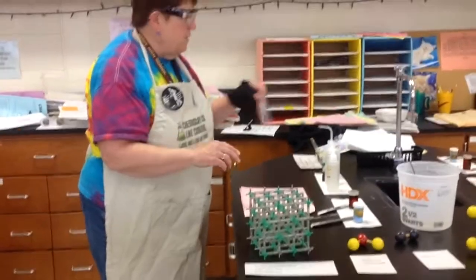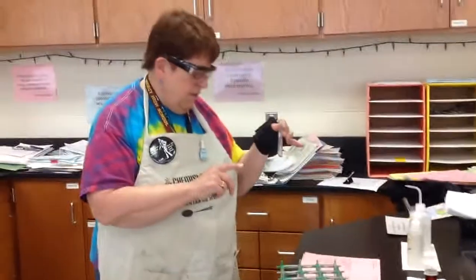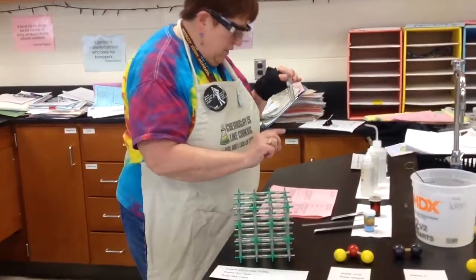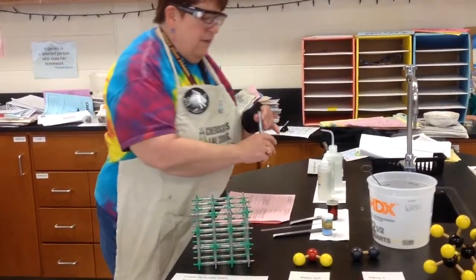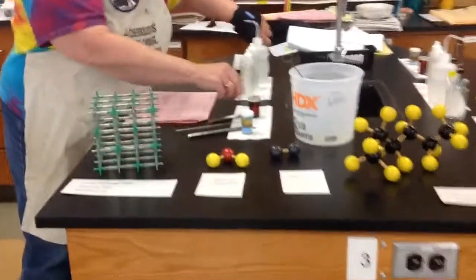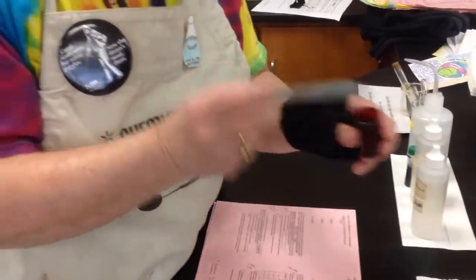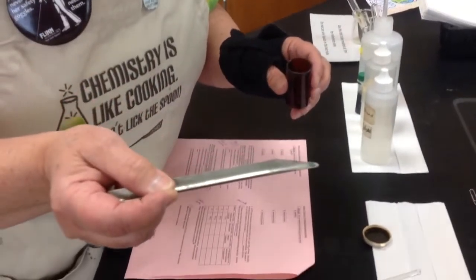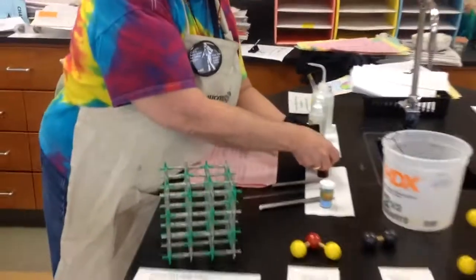All right. And then you will do a similar thing with water again, just with water in the 2 test tubes. And then it says a match head size amount of iodine in 1 test tube and a match head size amount of copper sulfate in the other. So the solids are here. Match head. You know what a match looks like. Just a little teeny tiny bit of this. If you use too much, you will not be able to tell what you are doing. And that's probably more than a match head right there, like 3 match heads. So just a little tiny bit will work better.